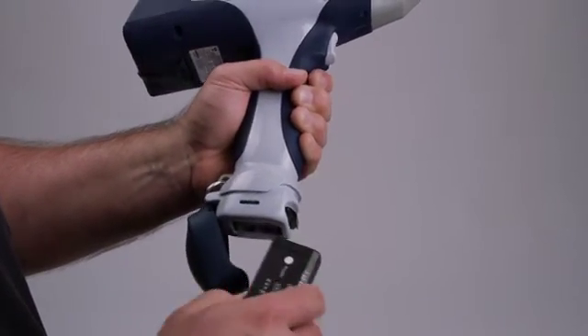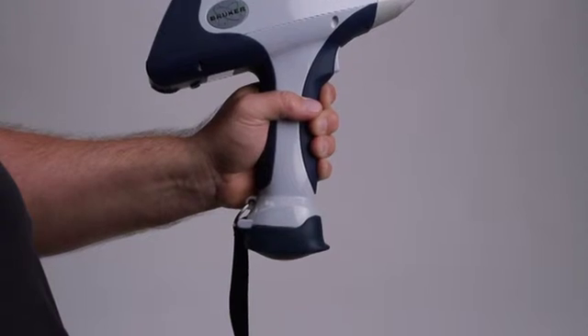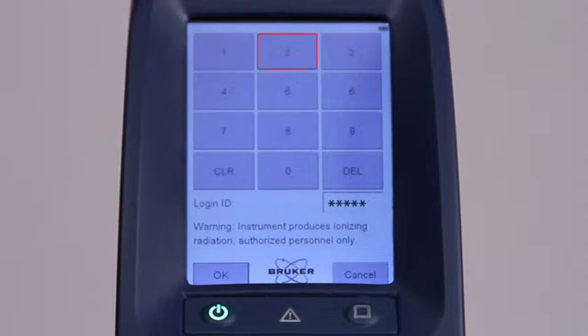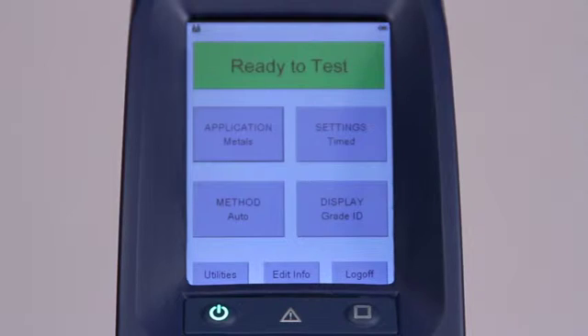To prepare the instrument for normal operation, it's necessary to install a fully charged battery. To start the analyzer, simply push the power switch on the control panel. This will start the initialization process. When the initialization is complete, you'll see the login screen. Tap the login button, enter the password 12345, and tap OK. When the radiation warning window appears, pull the trigger to acknowledge the warning. The main menu appears and indicates 'ready to test' at the top of the screen. When the S1 Titan is turned on, all the settings will be exactly the same as when it was turned off.